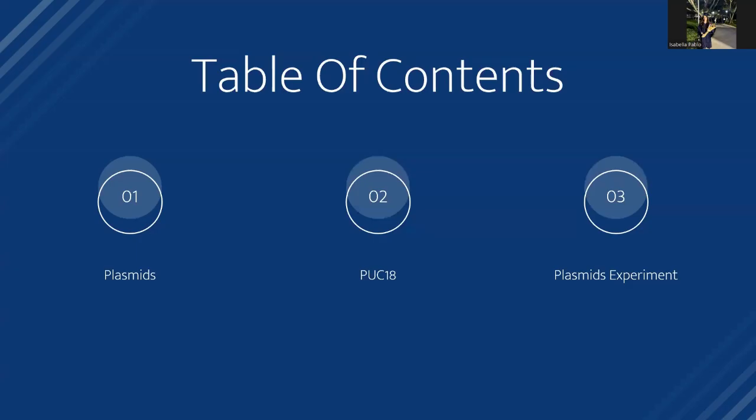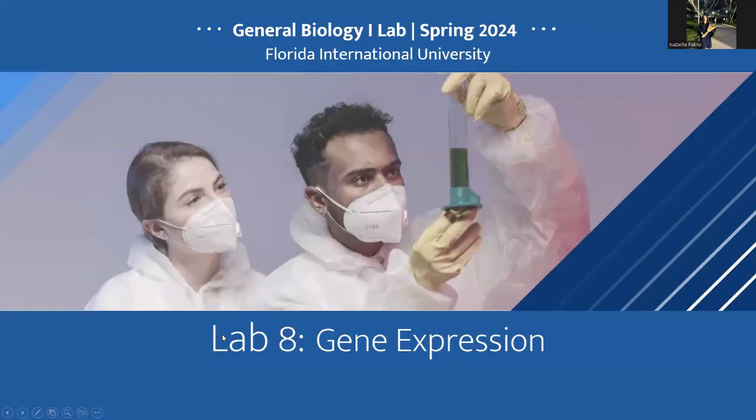All right. Hello, everyone. Today we're going to be doing the gene expression lab. This is lab 8, gene expression. I'm going to explain the experiment in detail, show you guys results, and you guys will fill out the test sheet using that.